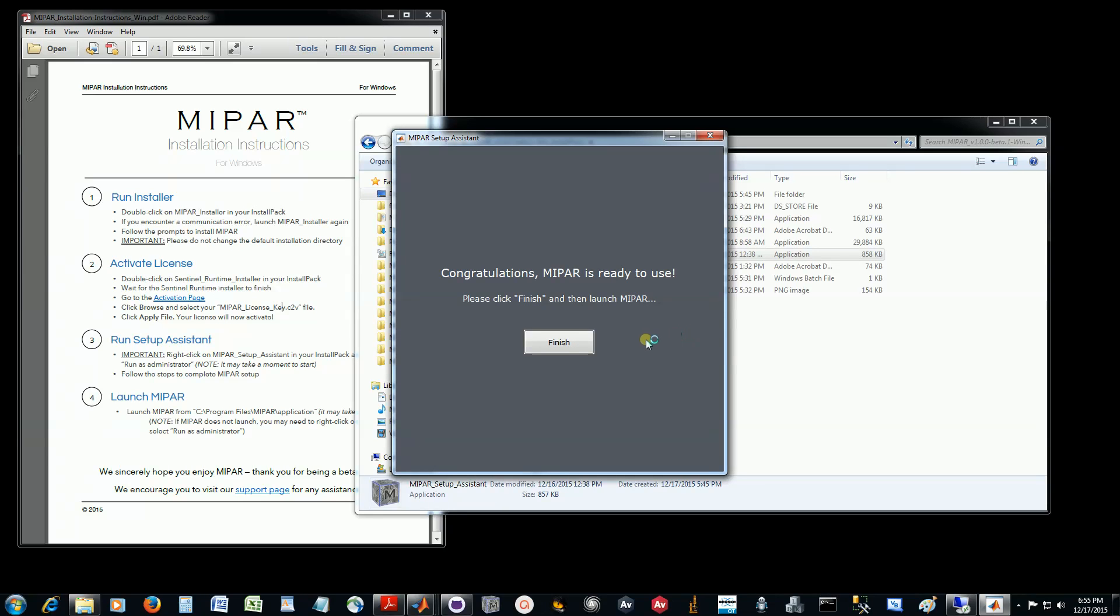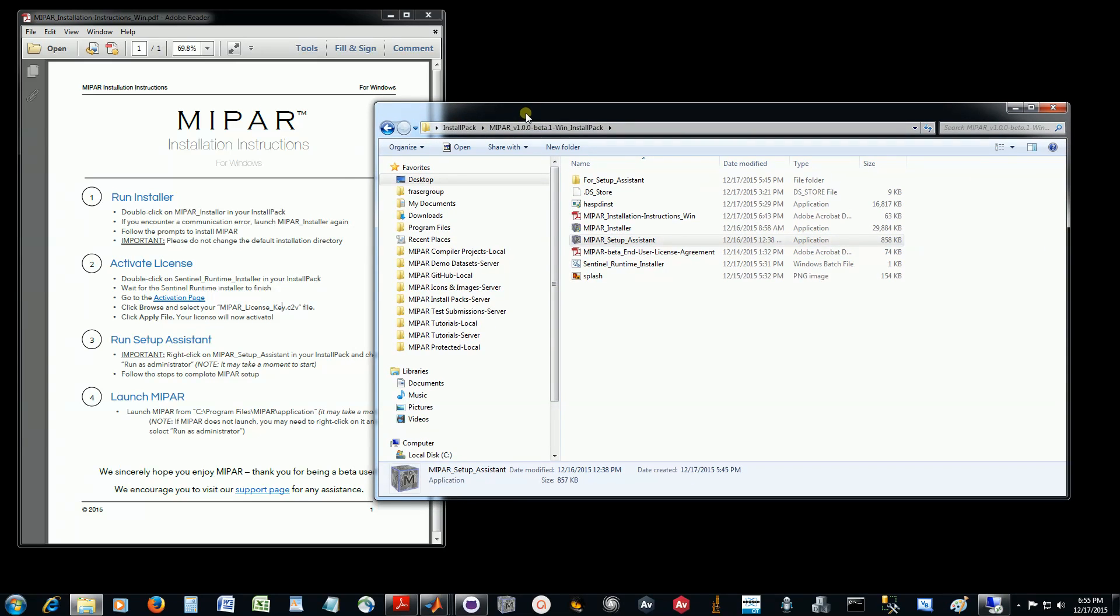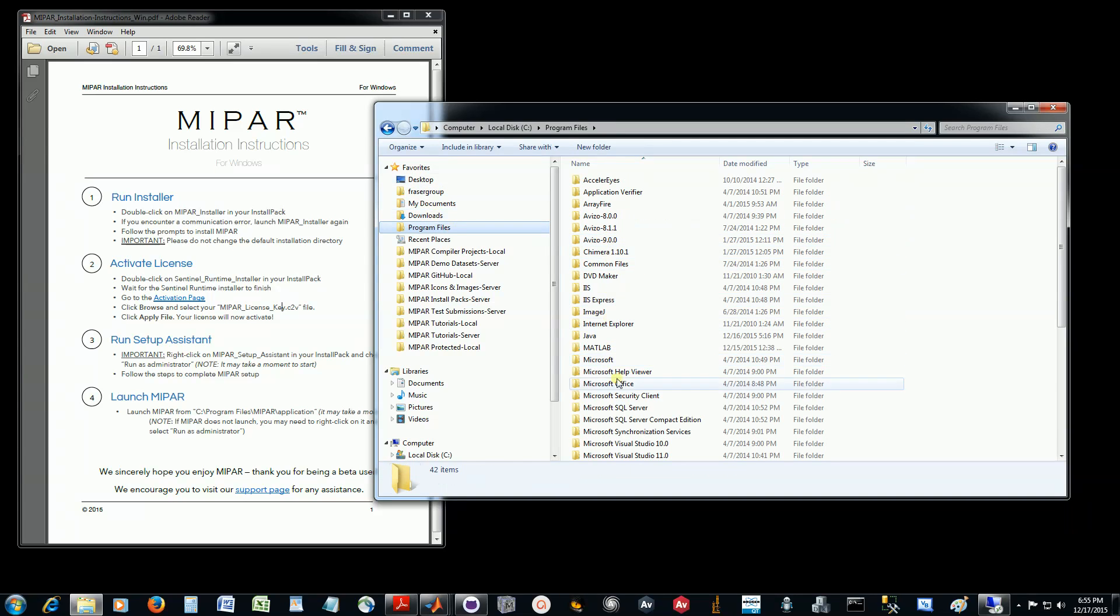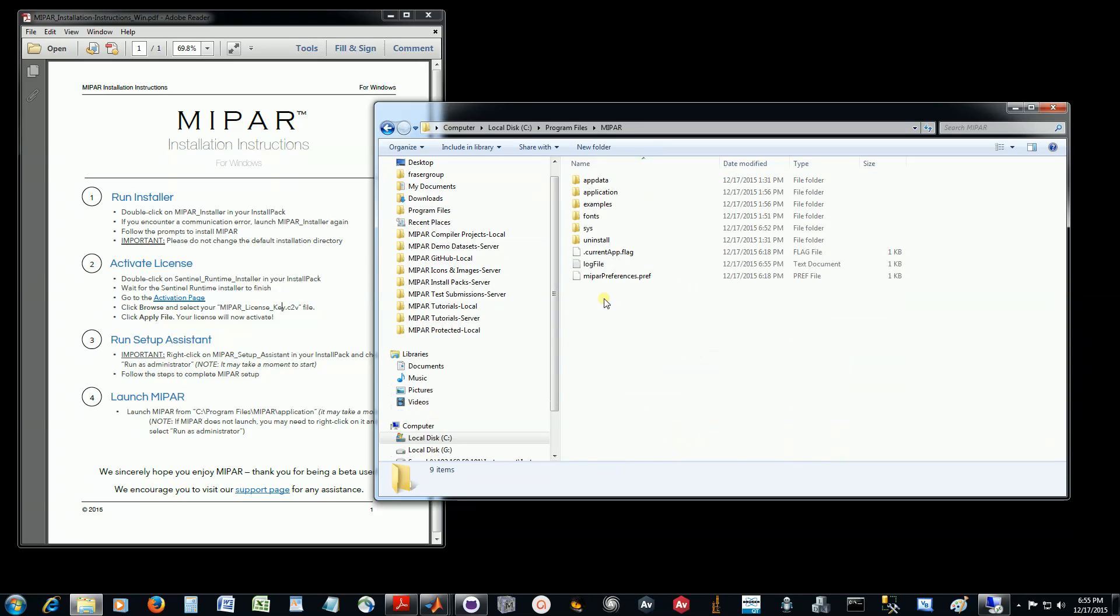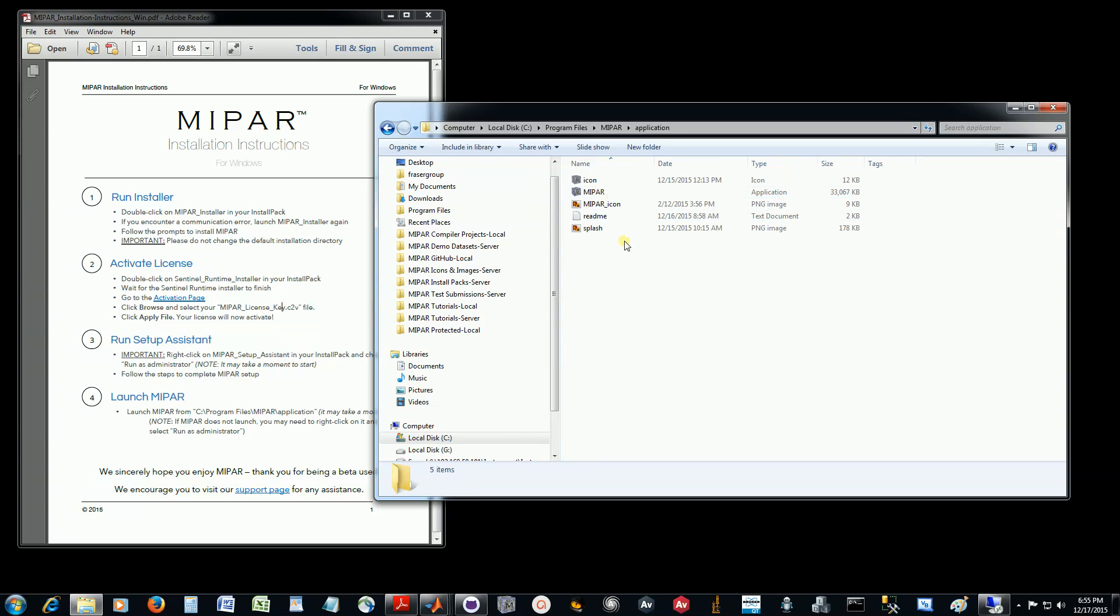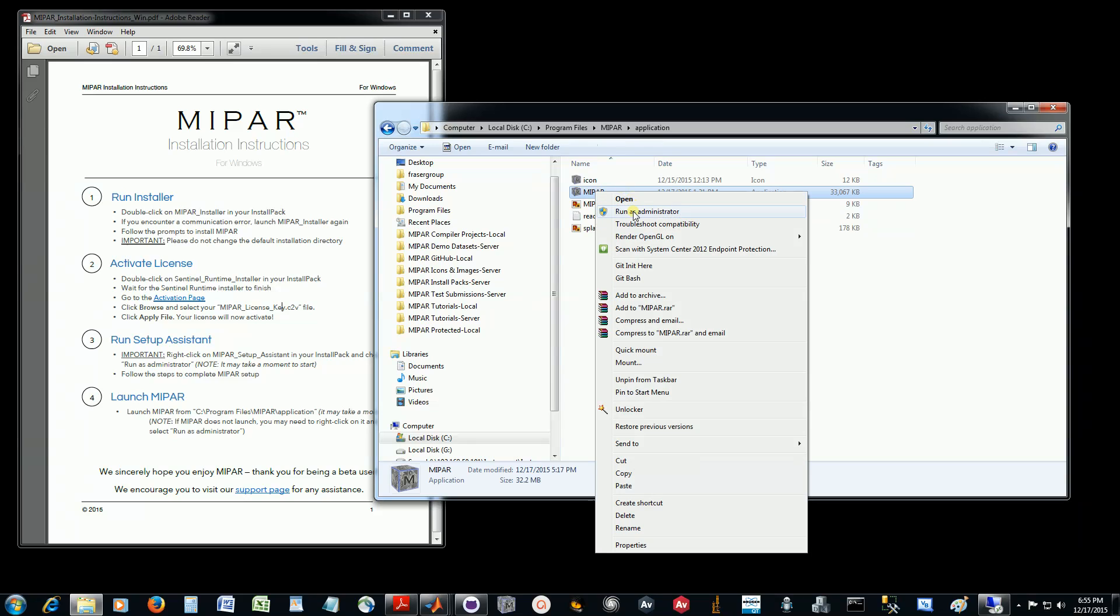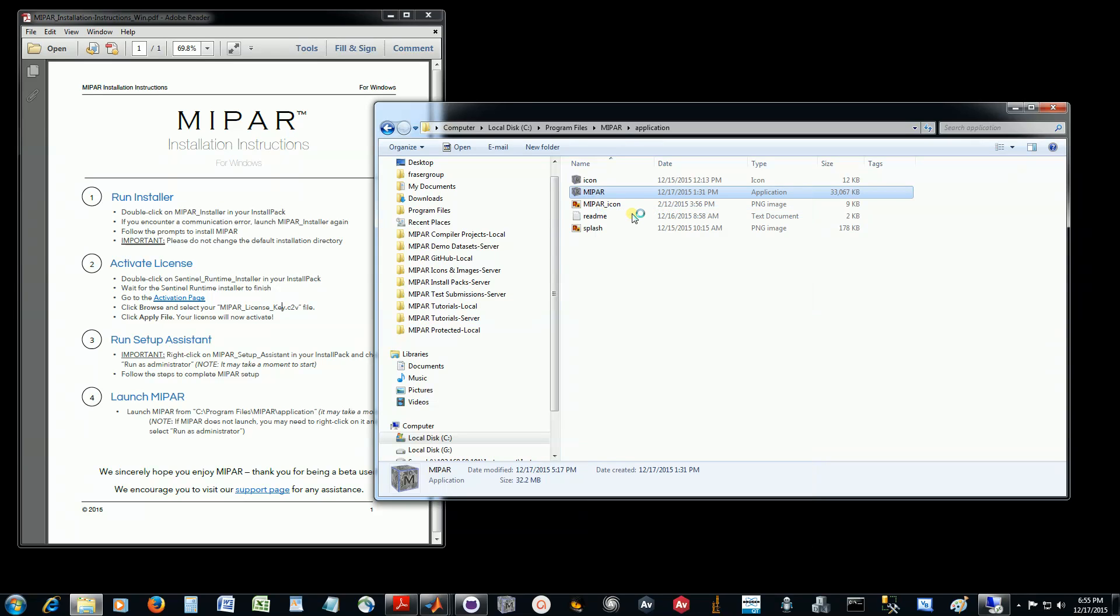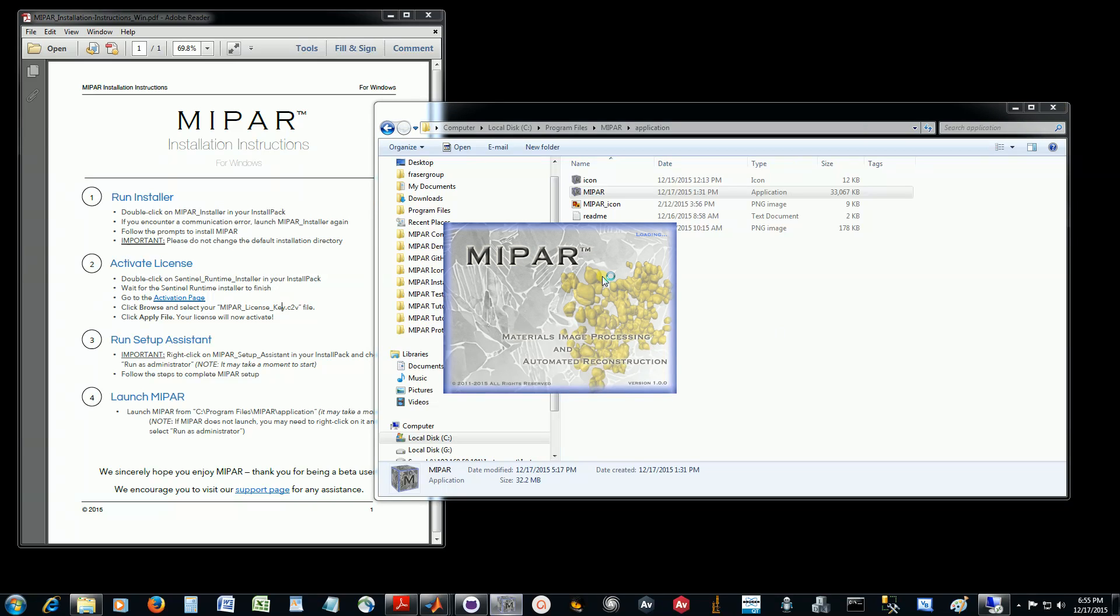And there we go. MyPar is ready to use, so we can click Finish. Either from the desktop shortcut that was created or the installation location, which on a PC is Program Files MyPar application, you should be able to just launch it conventionally by double-clicking. If not, again, do right-click and run as administrator. MyPar should start up for you. It may take a while to start for the first time.